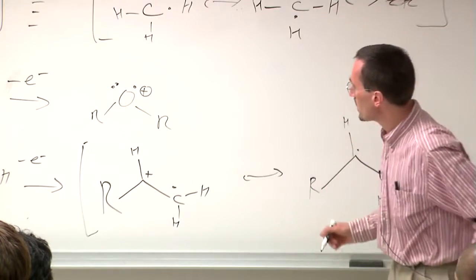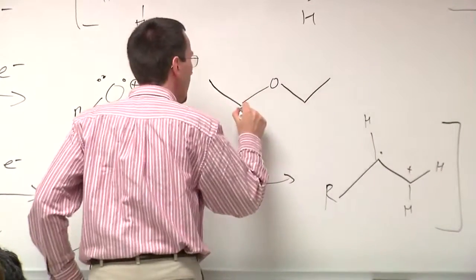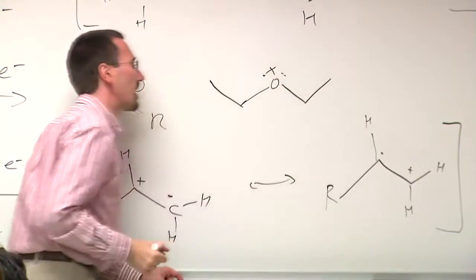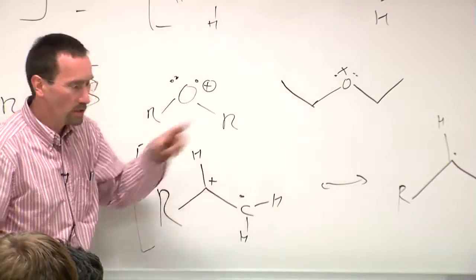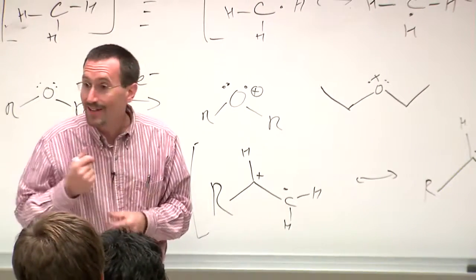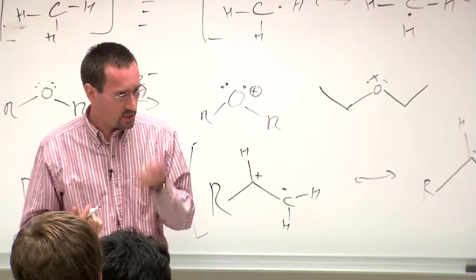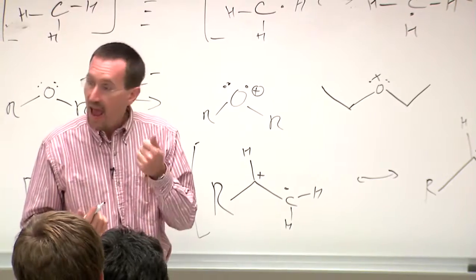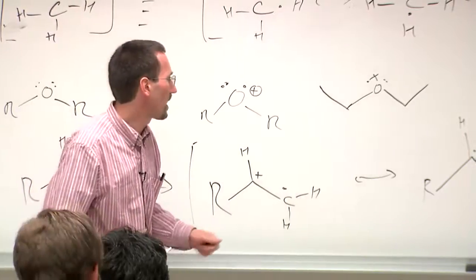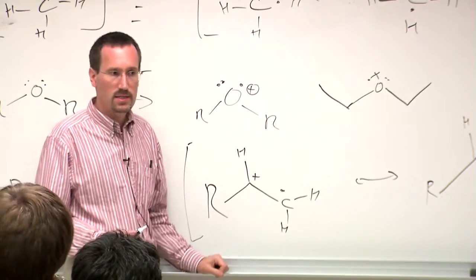So for example, later on we're going to see that if you have an ether like, well, I'll make it simple, like diethyl ether, and this molecule breaks apart, because when you give it a whack with an electron, you put a lot of vibrational energy. So you've done double damage to the molecule. You've decreased the number of bonding electrons, so you've weakened the bonds in the molecule. And you've put a lot of kinetic energy into the molecule in the form of the impact from the electron. So the molecule now is vibrating, it is hot, and it has a tendency to fragment.